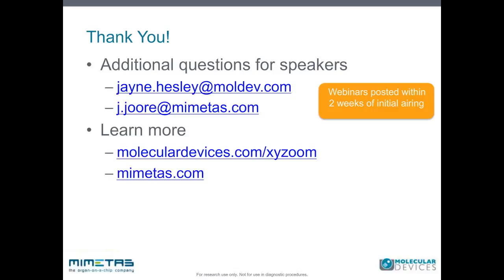Like some of the neuronal cultures, it can take up to 2 months before you get neuronal differentiation, and we follow that using imaging. And also some of the tumors that we culture, I think the record at this point is just over 6 months of a single tumor growing inside an OrganoPlate. It's a glioblastoma tumor, and we image that tumor at regular intervals by putting it into the incubator in between.